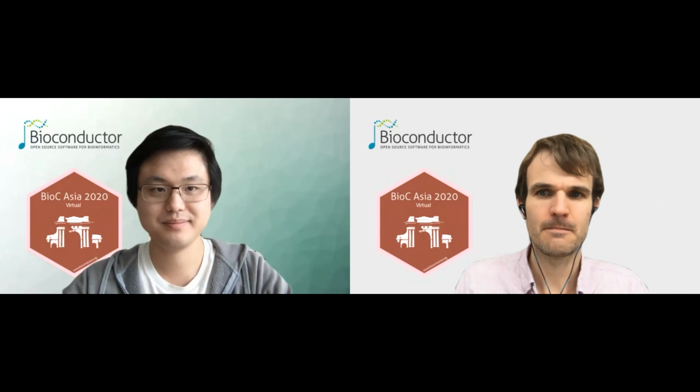Are there many other packages, Shian, for long-read analysis in Bioconductor that you know of? Not in the existing release. I haven't kept an eye on the submission queue. Hopefully more people are working on this, but as far as I know, there's not much going on.